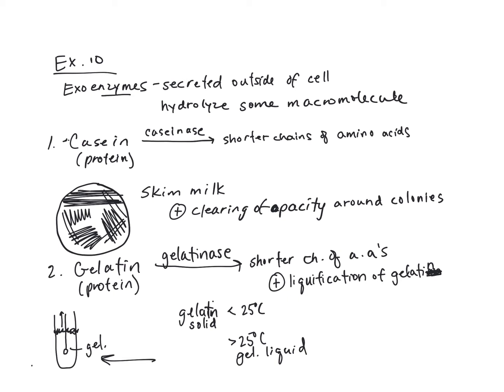That's the main reason that gelatin wasn't an acceptable solidification agent to add to our nutrient broths, because even though they were solid at room temperature, when we incubate them to try to get our organisms to grow faster, it liquefies. All right, so agar has a much higher melting temperature, 100 degrees Celsius, whereas gelatin starts to liquefy above 25.